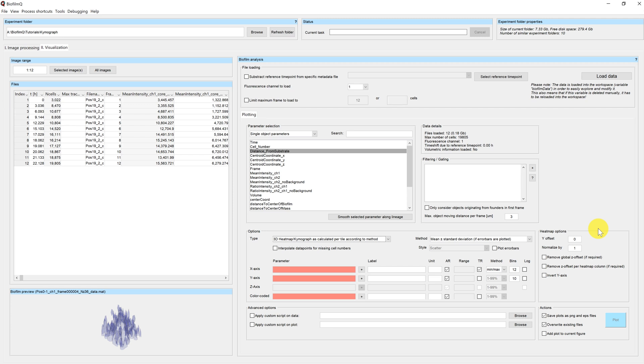Here you can choose to change your heatmap after plotting, by applying an offset to the y-axis, by multiplying each value with a constant.